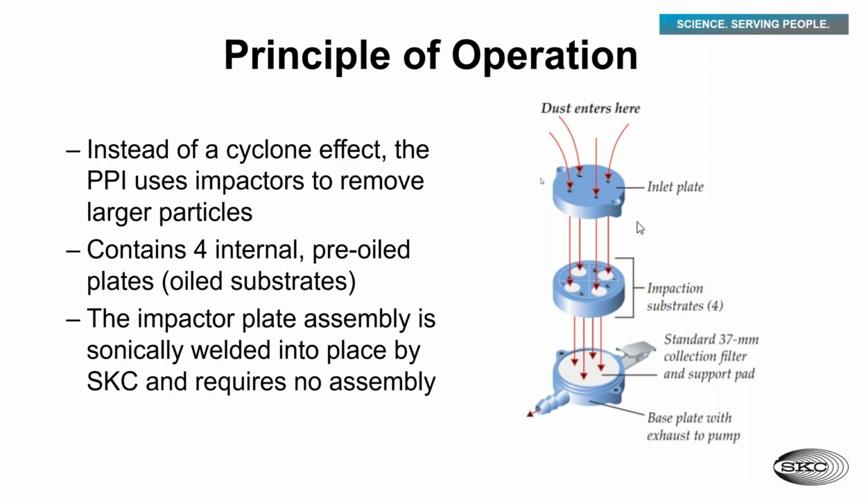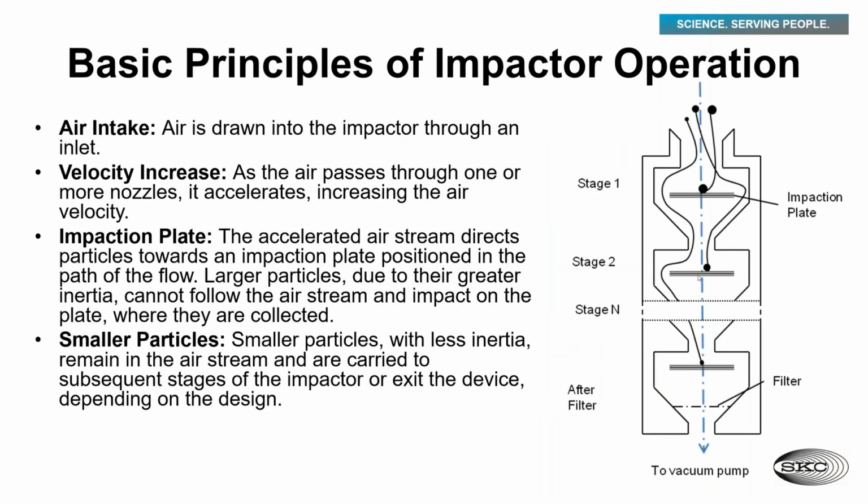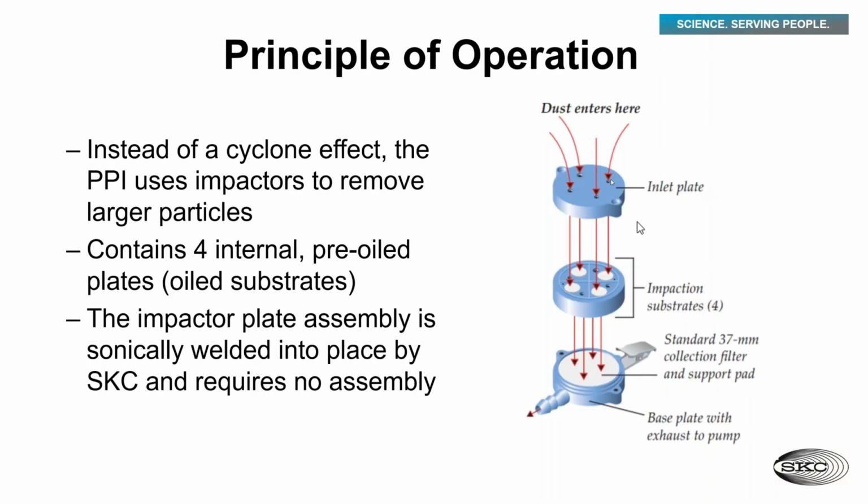So what's interesting and what's different about this particular impactor versus this one right here, this one uses 4 different sized inlets to capture 4 different sized parts of that respirable curve. And so as air travels in through these curves, you'll notice that the inlets do not line up. Directly under this inlet is an impaction plate, same with this one and all the rest.